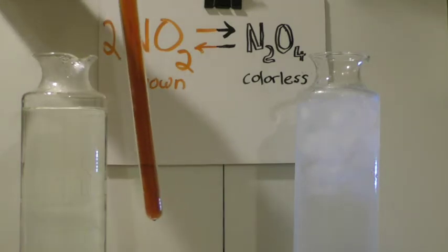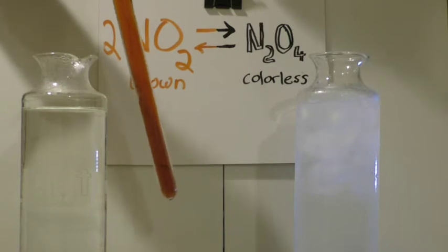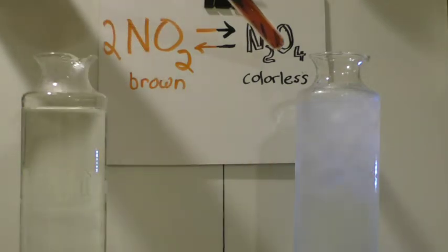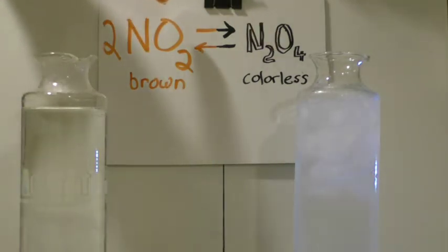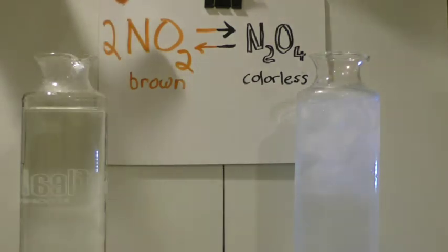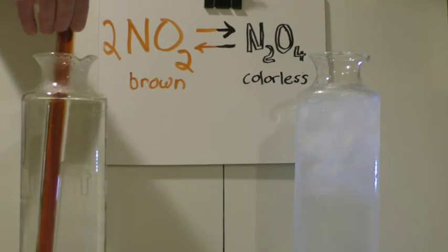But up to this point in our chemistry careers, we've just done stoichiometry that says if you take some NO2, I can predict that when I let this reaction start, I should produce N2O4, reactants convert into products, and I can even predict that I should form half as many molecules of N2O4 as the number of NO2s I started out with. But I want us to watch what happens.